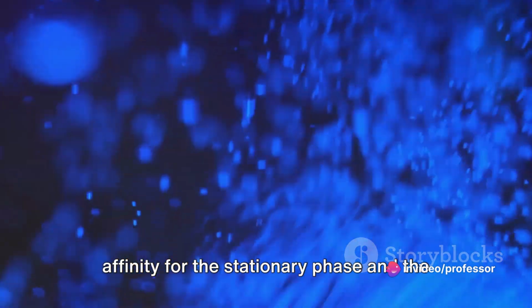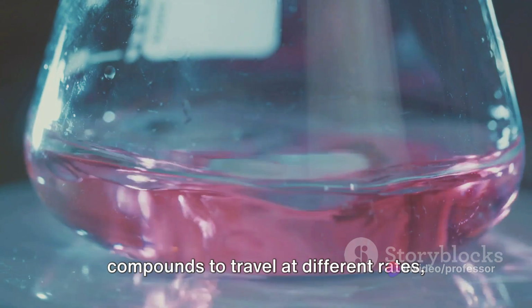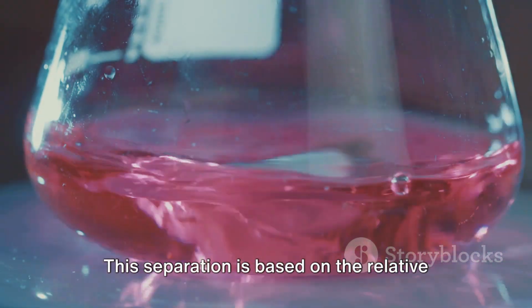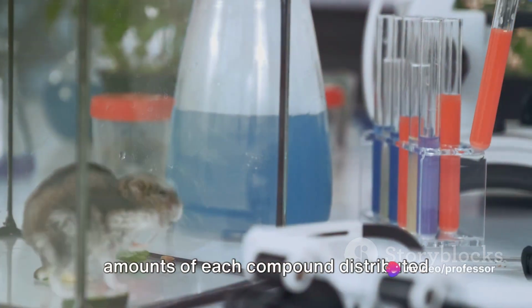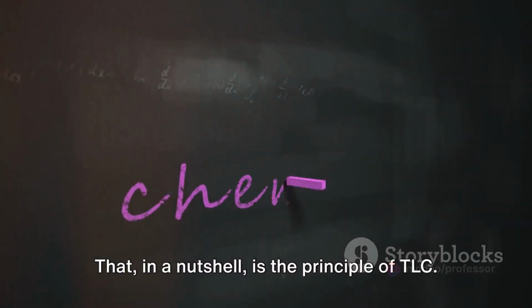Now, every compound has a different affinity for the stationary phase and the mobile phase. This difference in affinity causes the compounds to travel at different rates, thereby leading to their separation. This separation is based on the relative amounts of each compound distributed between the stationary phase and the mobile phase. That, in a nutshell, is the principle of TLC.